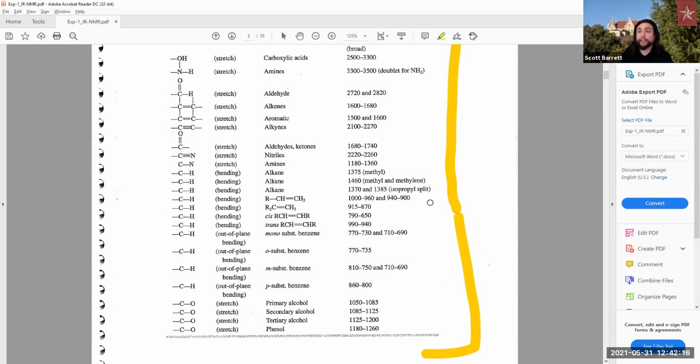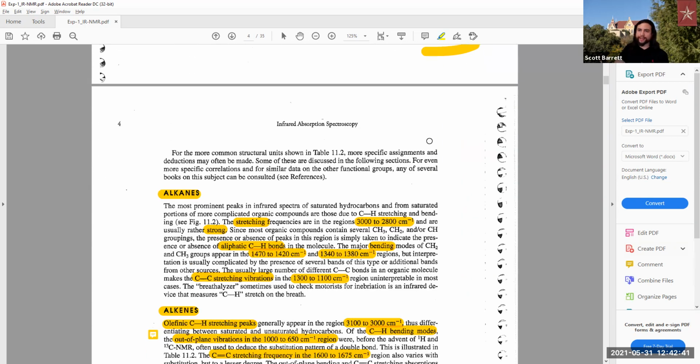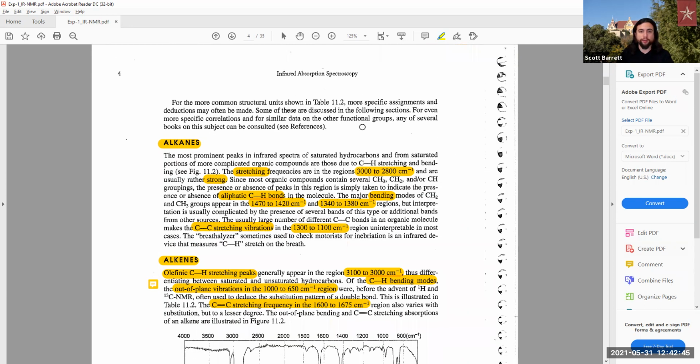If you say that it's at a specific wave number and there are 3 other functional groups at that wave number, that's not a good indicator for you, because you may be incorrect; there's a possibility of 3 other functional groups that are maybe peaking there. So memorize the unique ones, such as the nitrile that I gave as an example, and make sure to go through and understand the generality of where the other areas should be as well.